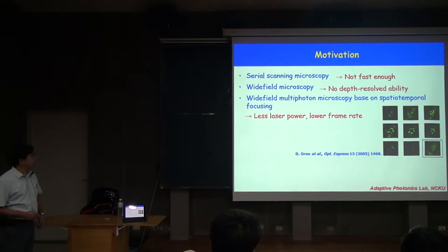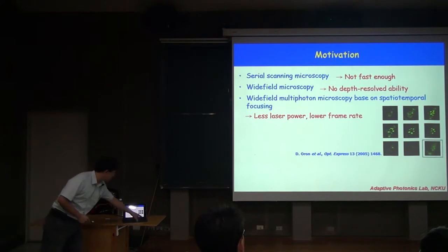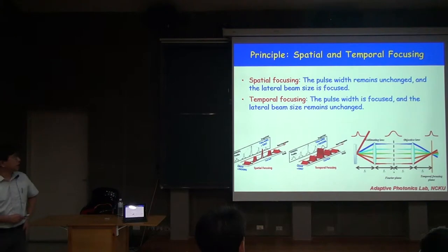So based on the temporal focusing, it's possible to use multiphoton for wide field excitation. So here I show you the difference between the spatial focusing and the temporal focusing.